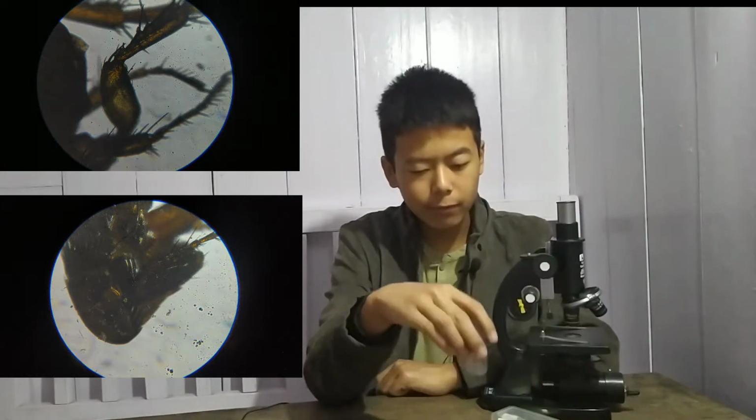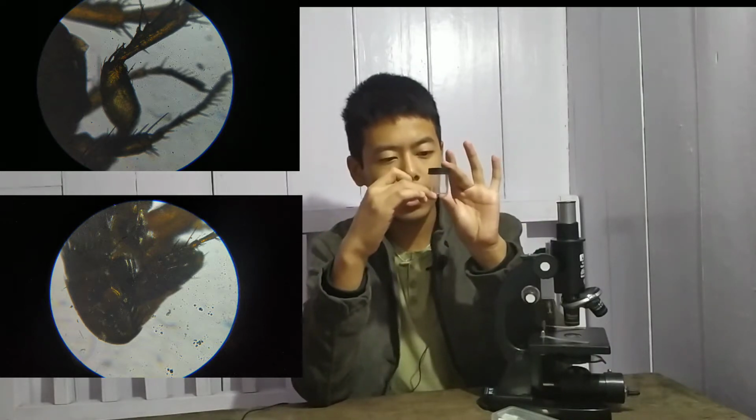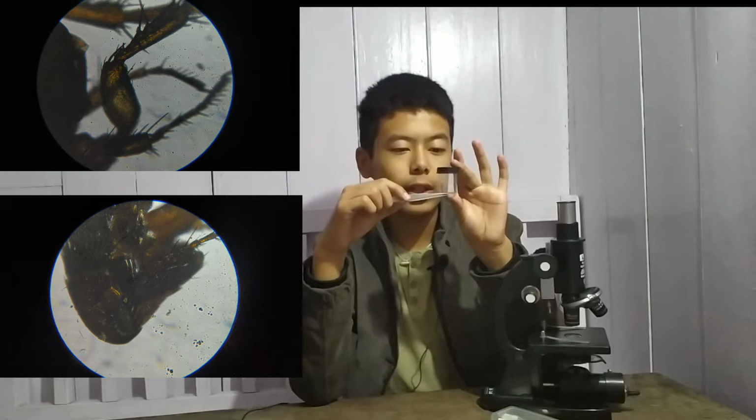So today, what I've got in my hand is actually some live animals or live organisms inside it. These are dog fleas, and they are pretty much small. I'm going to observe this under the microscope. So let's get started.